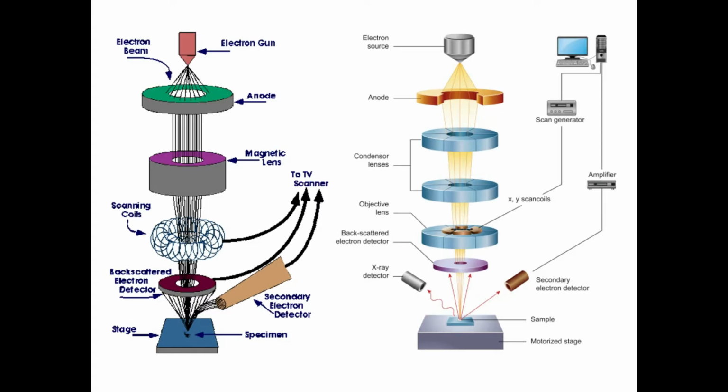Everhart-Thornley, and the backscatter electron detector is called a solid state detector. Okay, most probably we are using that. If any other names also come up, don't get confused by that, just simply say it's a solid state detector. In the exam also you can use the words solid state detector. It is not a big mistake. Okay, I will not reduce any marks.